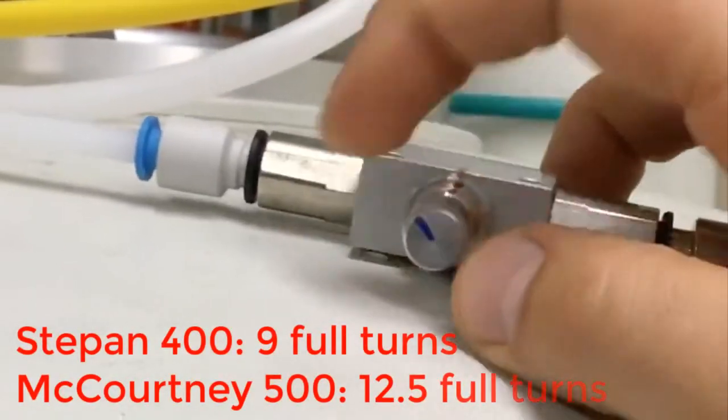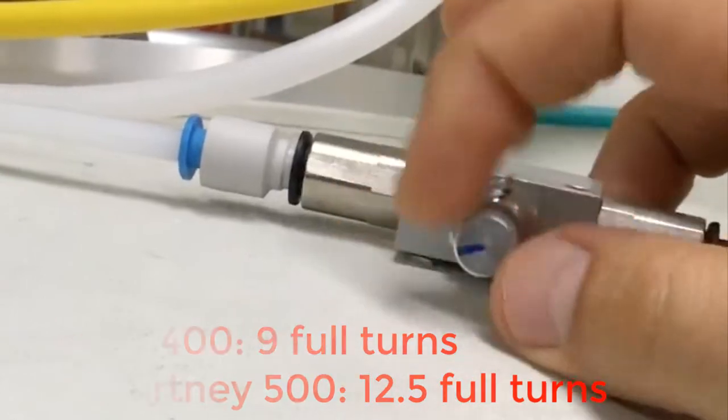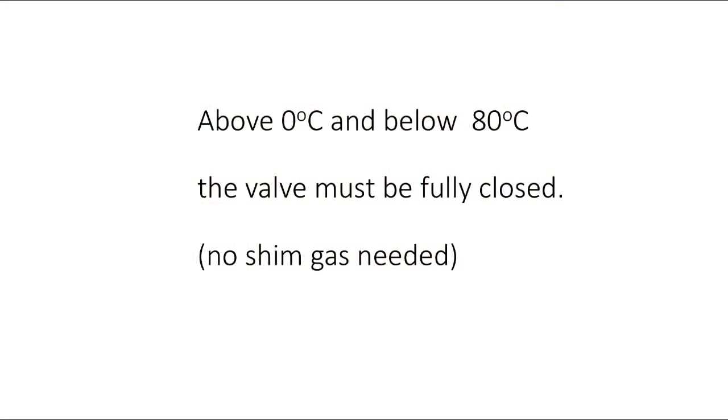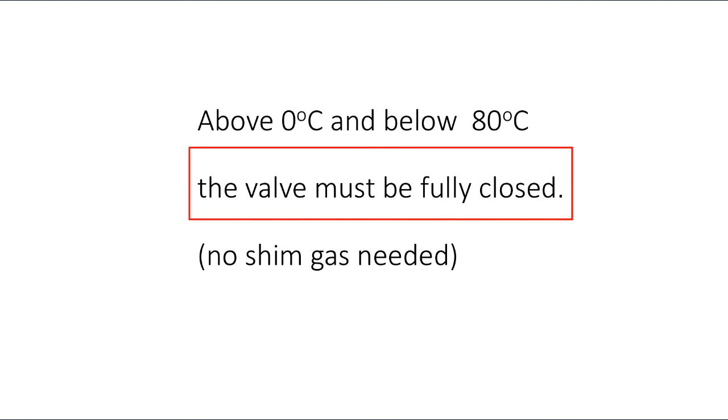Each NMR system has a specific number of full turns you need to make to open the shim gas correctly. When the experimental temperature is going to be above 0 degrees C and below 80 degrees C, the valve must be fully closed — no shim gas needed.